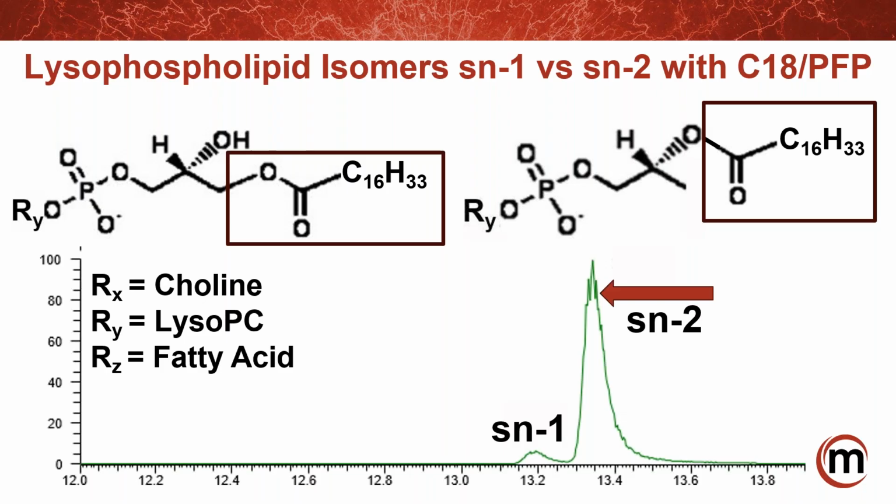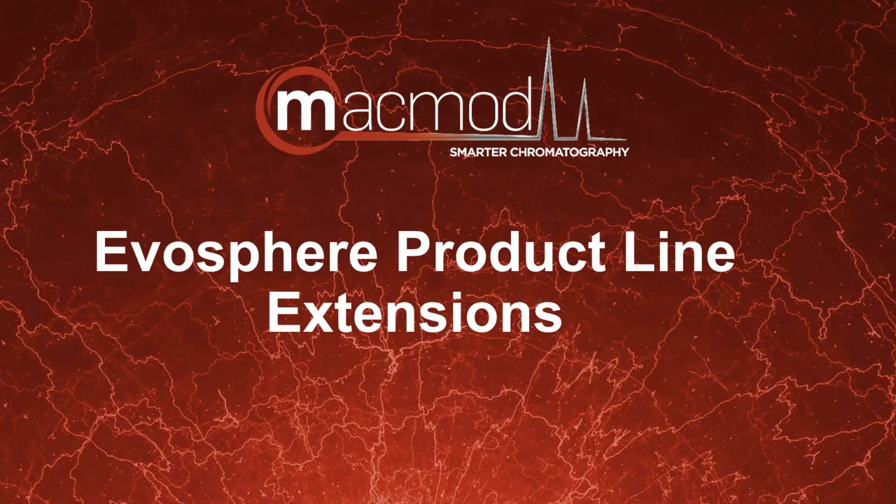One, very close molecular structure, but slightly differences. That's how powerful the phase is, and using it on the monodisperse particles.